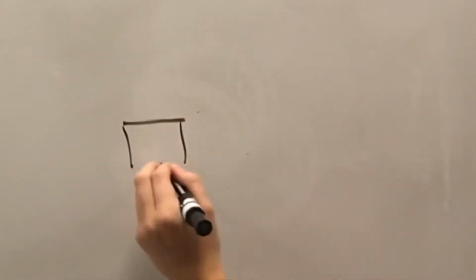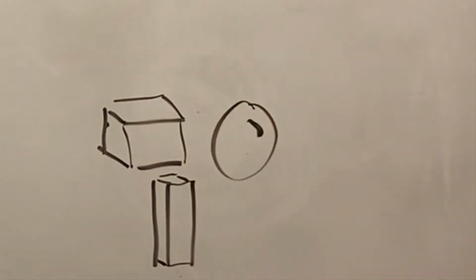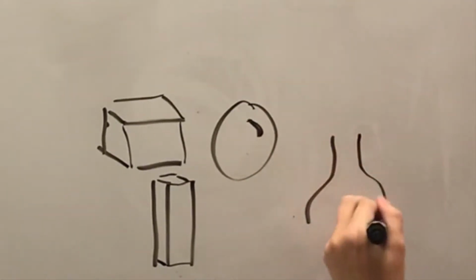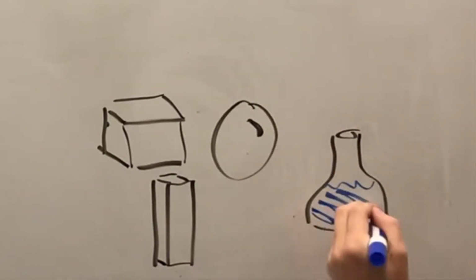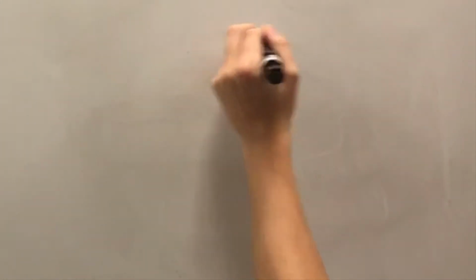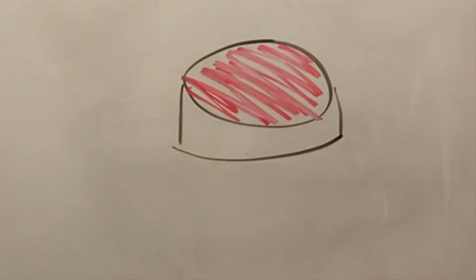The minimum sample size for a solid sample is 0.1 grams and 0.5 microliters for a liquid sample. It is important to consider sample stability and flatness, otherwise it will be difficult to focus the light. One major advantage of Raman spectroscopy is that virtually no sample preparation is required. This is because the technique measures how light is scattered off a sample rather than absorbed.